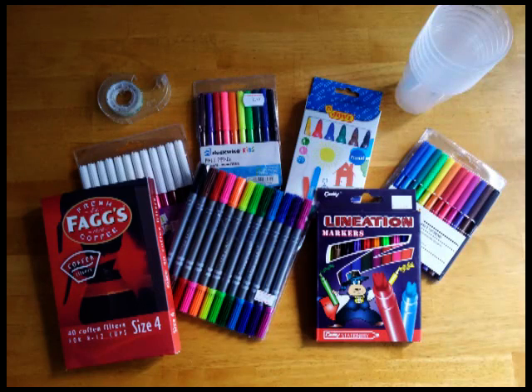All you need for this experiment is a few packs of coloured felt tip pens, some sellotape, some plastic cups, and some filter paper. Now if you can't get filter paper, if you don't have a lab technician, coffee filters work perfectly fine - just get some coffee filters from the supermarket.